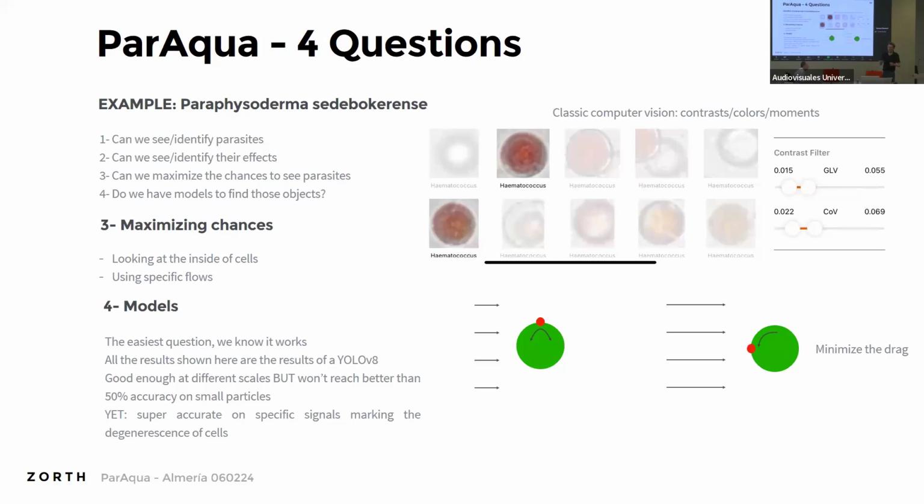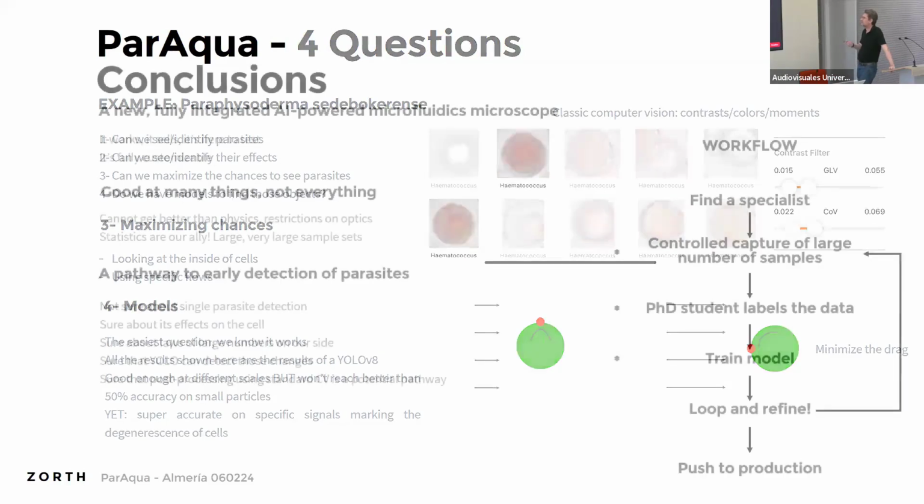The law of large numbers is playing for us. Right? If I measure 100,000 cells, how many do I need to know that my parasites are there? How many are relevant? 10, 20, 100? Very few. So it's just a matter of being able to capture 1 out of 2. I can live with that. I don't know if you can, but I probably could.